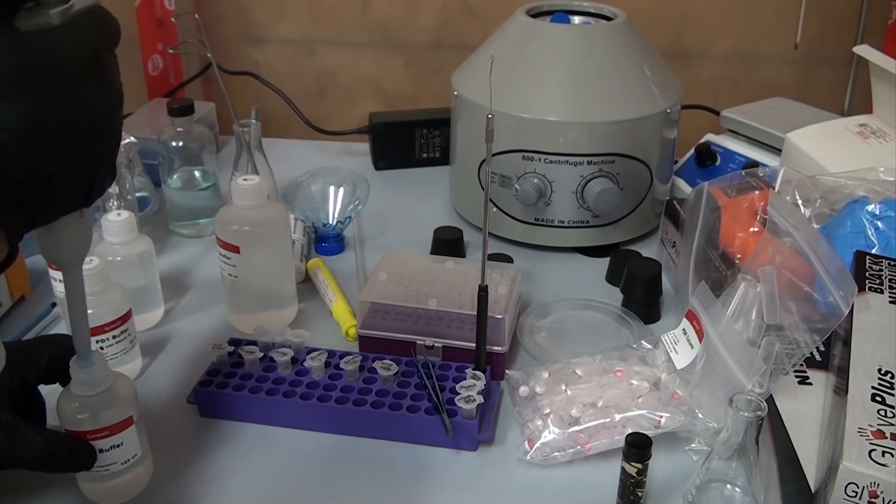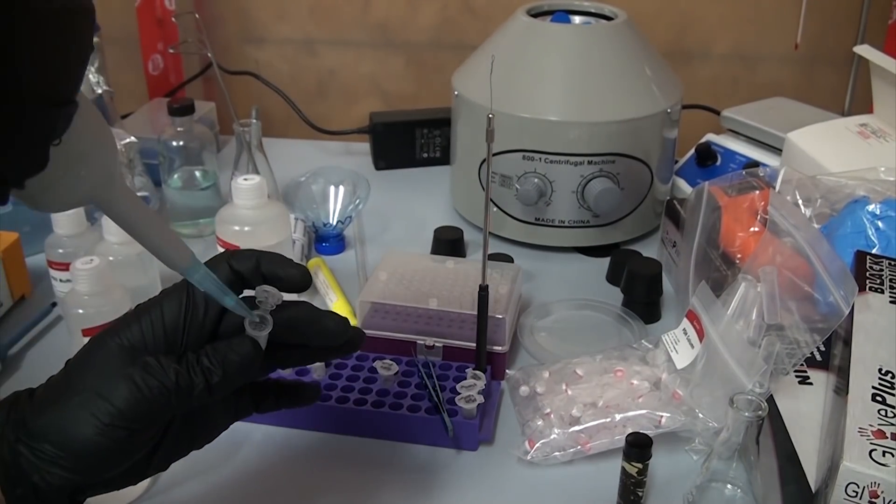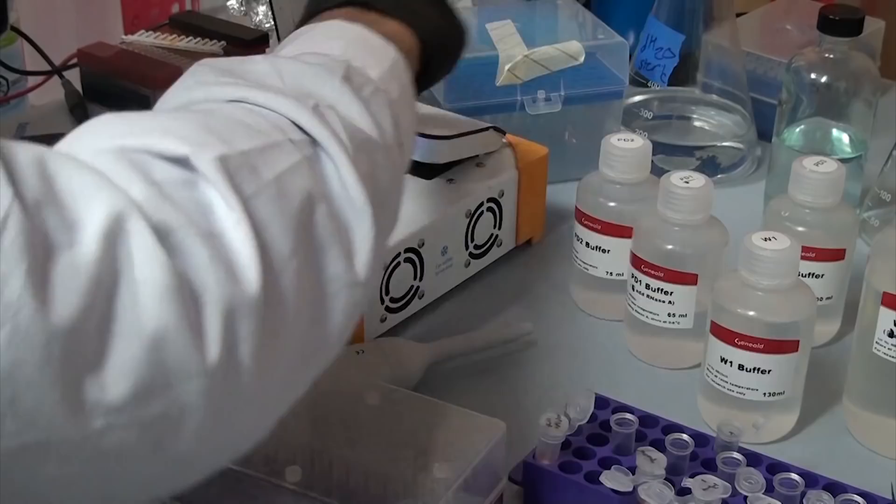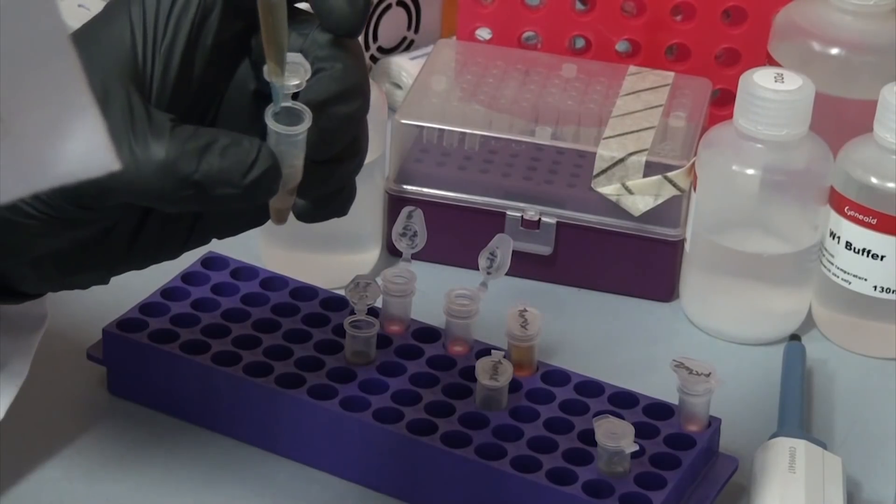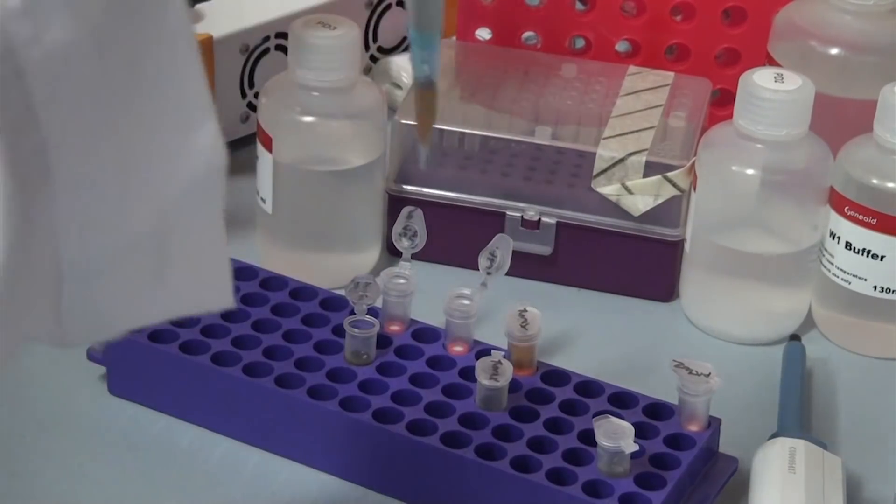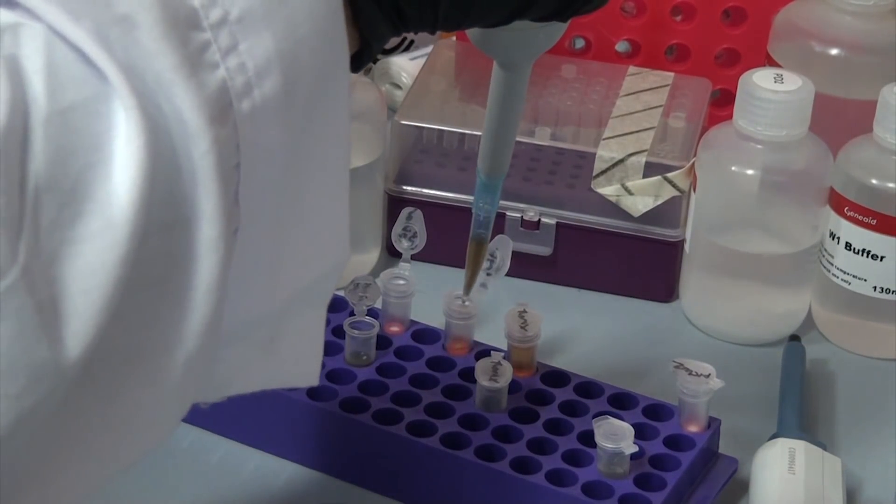Once it's done, we add PD-3, which seems to crash out all the proteins and debris from the solution, making it go cloudy. We spin this down, which collects all the floating junk at the bottom, leaving our DNA in the solution. Then we carefully pipette off the upper liquid, called the supernatant, and run it through the filter using the centrifuge.